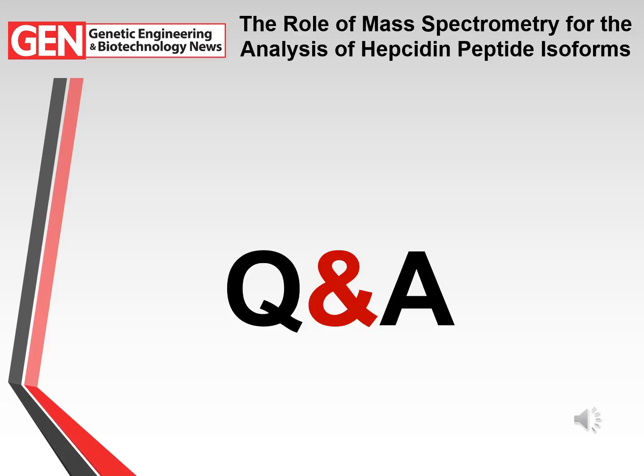I often show slides of samples that 20 years ago I would never have put into my instrument, where now I'm happy to squirt them in daily. So the manufacturers have played a great role in developing really good technology that is robust, and it's still evolving. They've developed really good software, and a lot of researchers have helped develop the software as well. The limits of detection have got better and better, and the ability to do MS and MSMS experiments has got better and better.